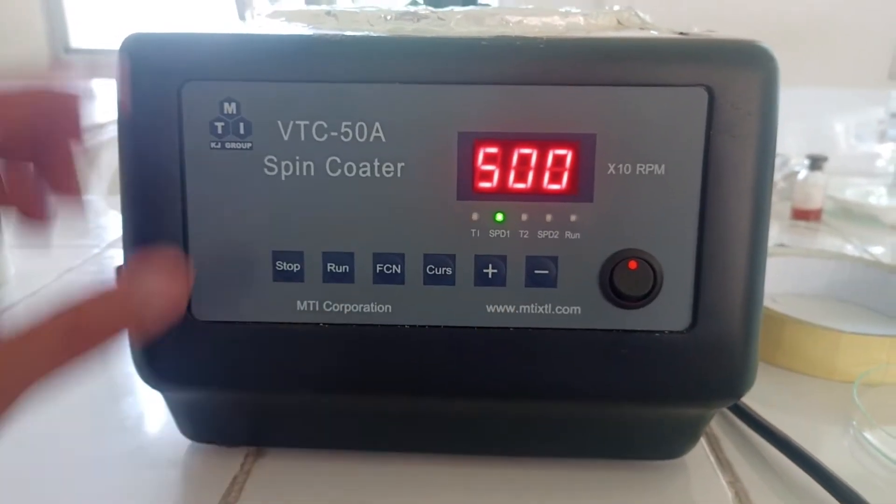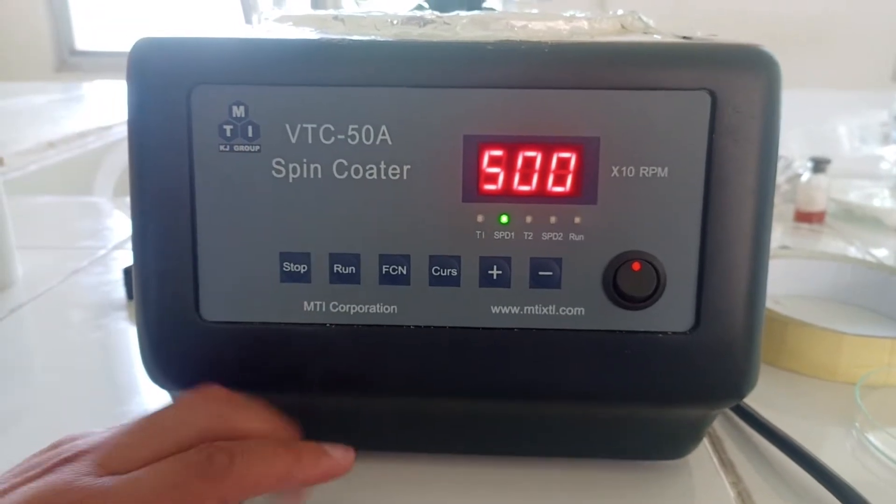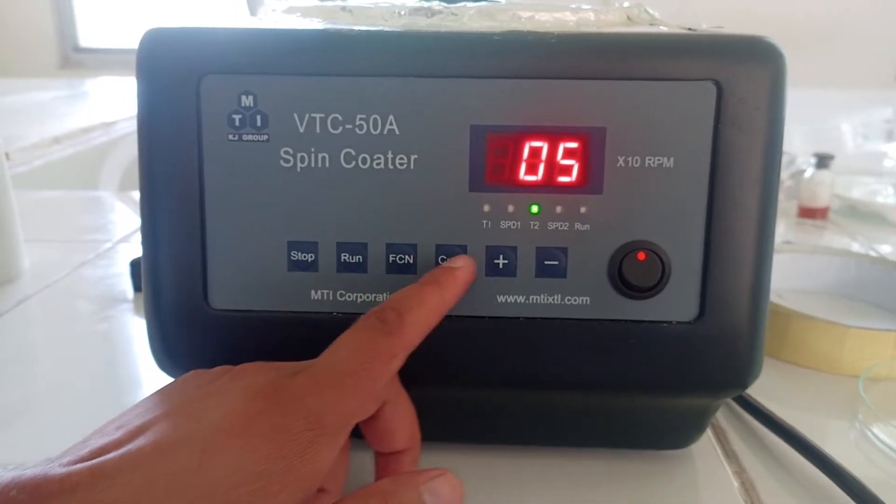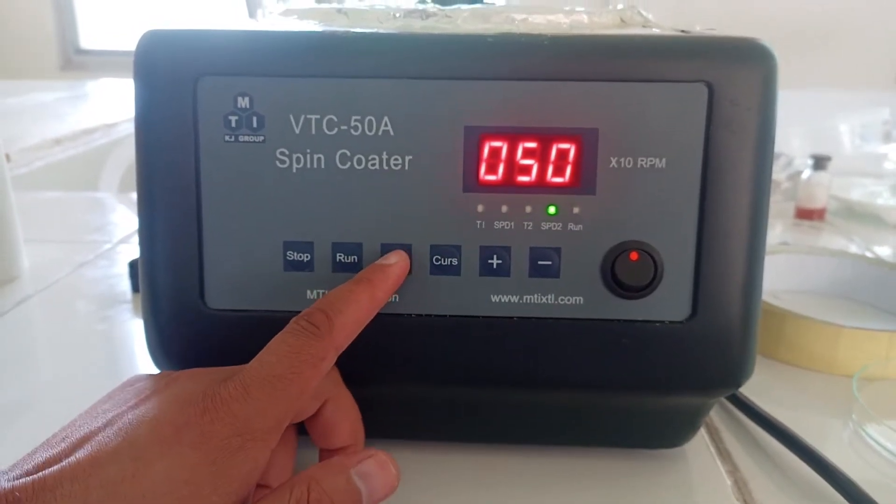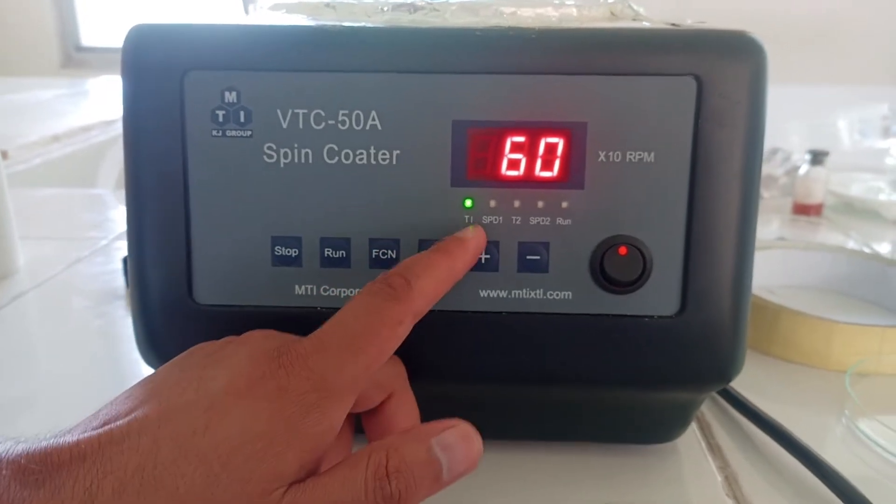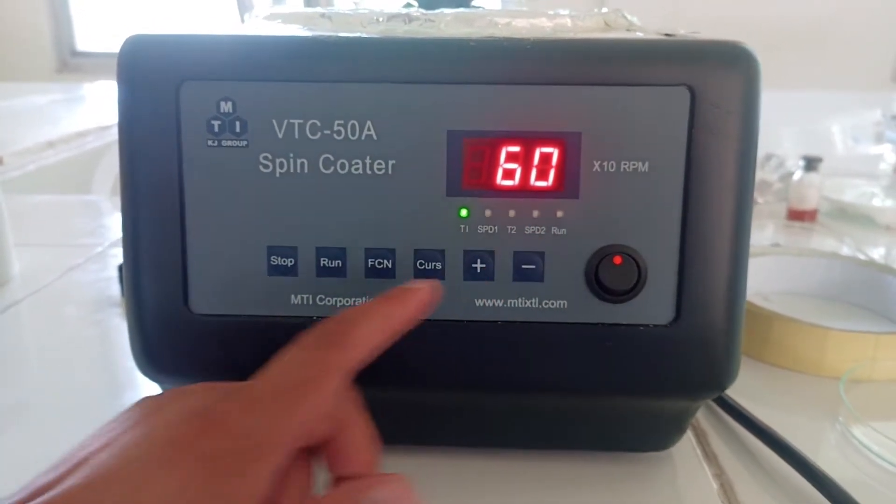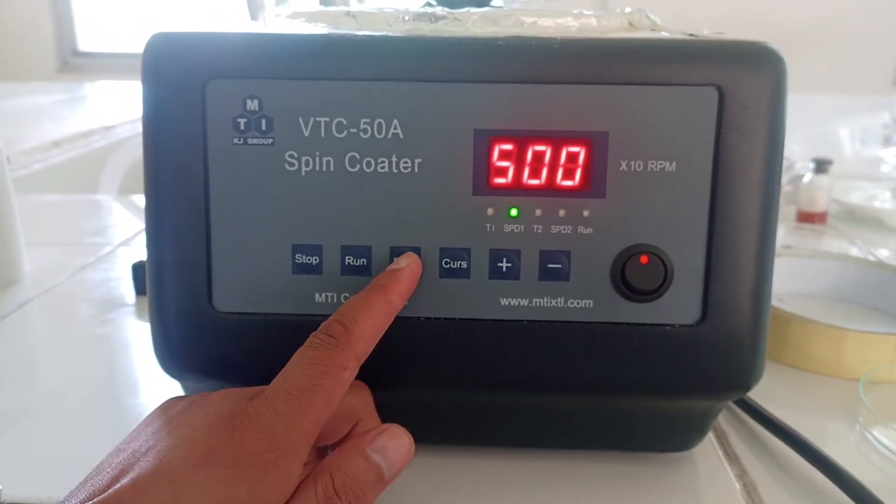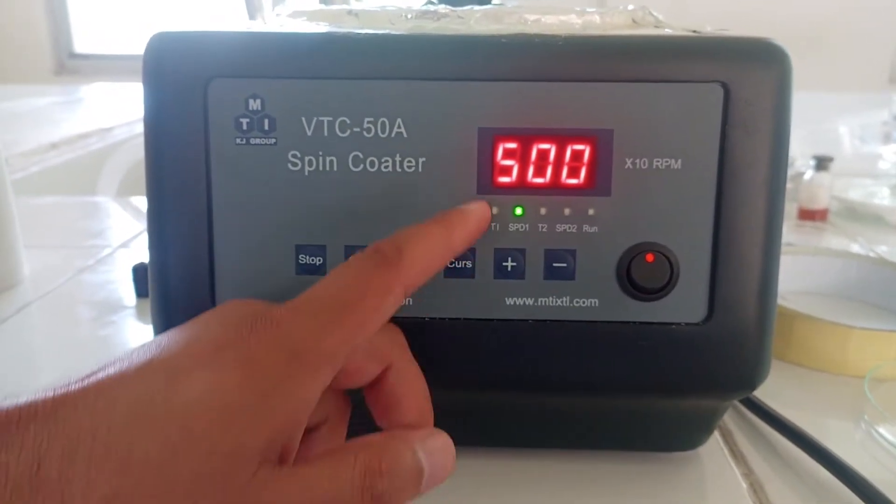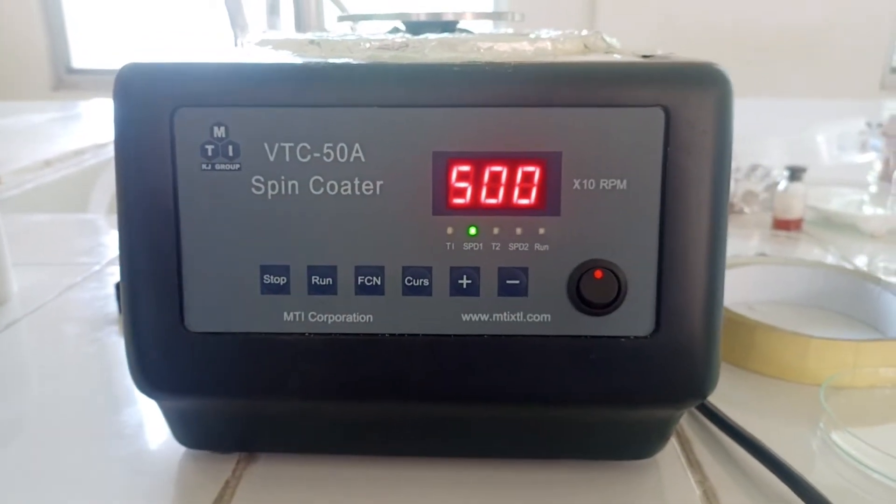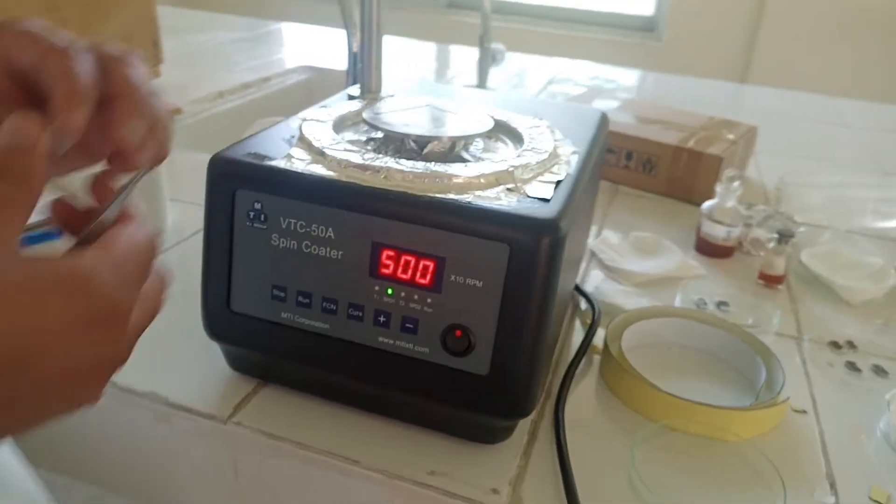We can select time and revolution per minute for this spin coater. Now we have set our program. We have 60 seconds for time one, we can also adjust second cycle and time two. We have 60 seconds time selected, and here we have first RPM that is 500 RPM.